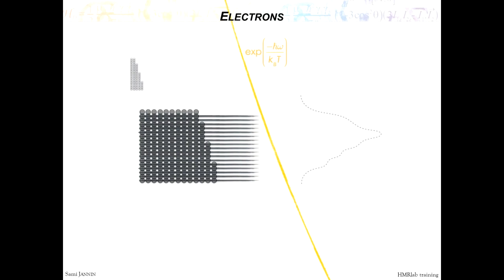So you have your electron spins that have different energy levels that are distributed at thermal equilibrium with a very high electron polarization. So this is spin down and spin up, which have a huge difference in population. There is a small gradient here because this is hundreds of megahertz, so we have a small gradient of polarization.